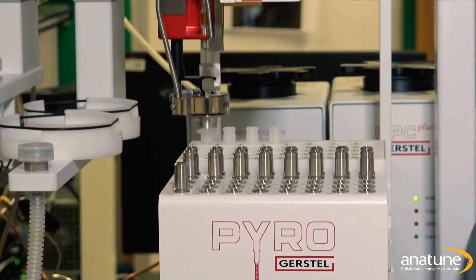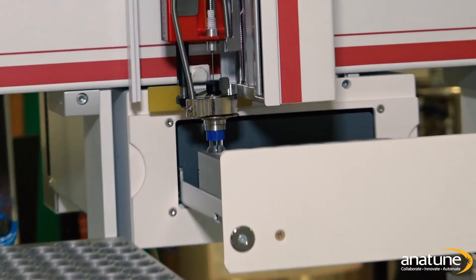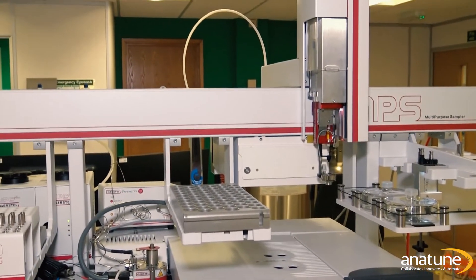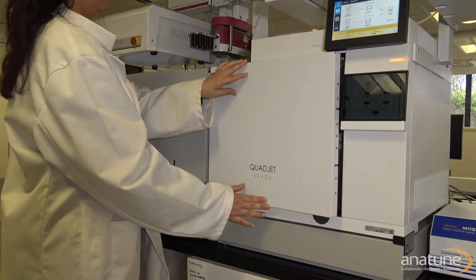The marriage of these two powerful techniques gives you the sample preparation capabilities that adequately match the analytical ability of two-dimensional GC-MS, all the while keeping your most talented method development scientists away from the mundane tasks that are performed robotically. To find out how this would work on your samples, get in touch today to arrange a demonstration.